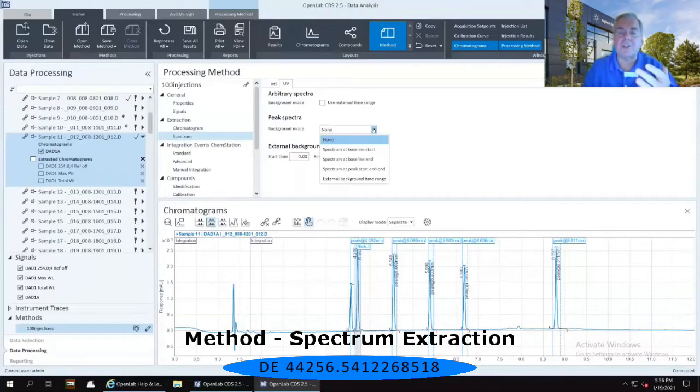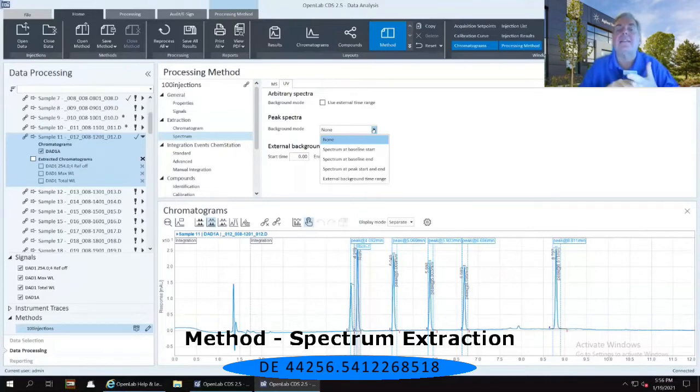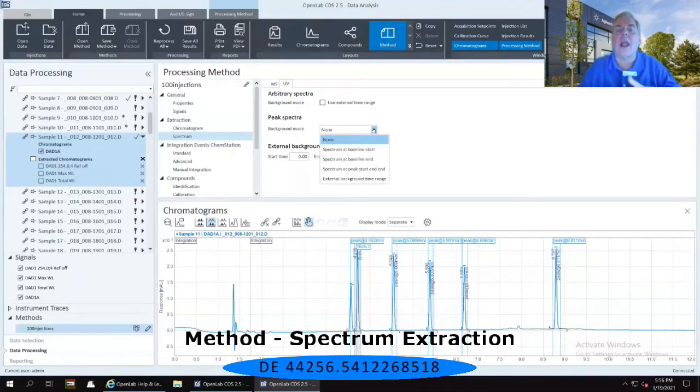You can do the spectrum at the start of the baseline, at the baseline end, at the start and end, or at some other type of external background time range that you can then define.